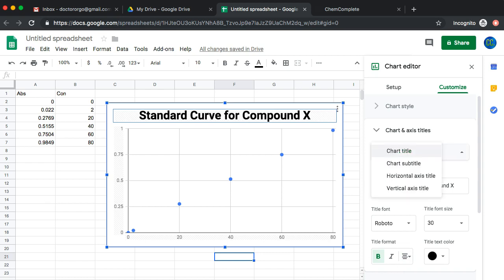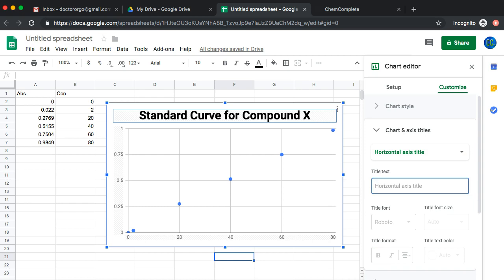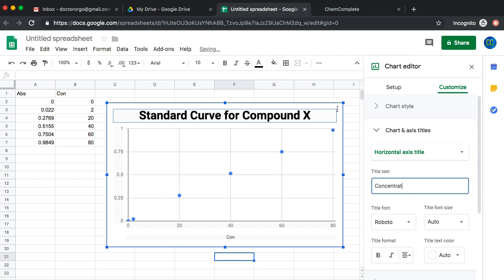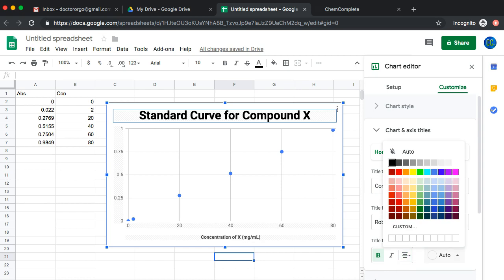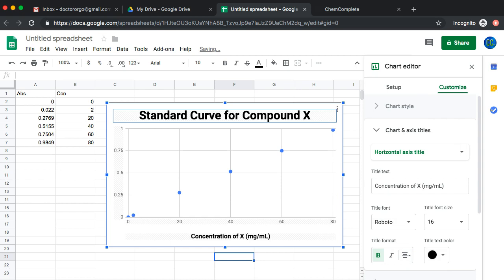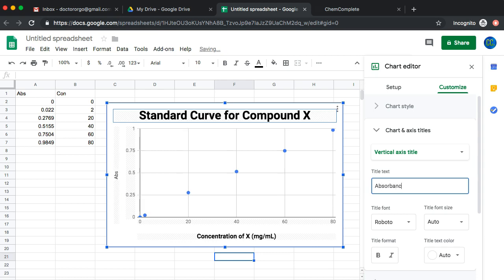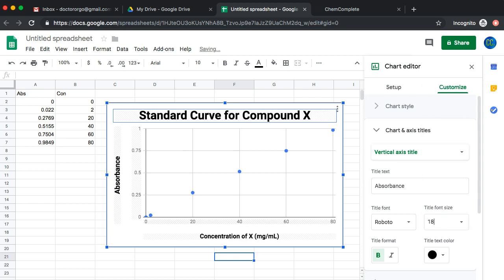It is absolutely essential that your axes are labeled. For horizontal, which would be the x, and the vertical, we'll go ahead and give it a title. We'll say concentration of X. Then you want to put your units after that. Let's say milligrams per milliliter. You would be keeping track of whatever that is when you're doing that. I'm going to make it bold, make it dark, and increase the size so our readers can see that. Then we'll do the same thing for the vertical. This is going to be the absorbance.